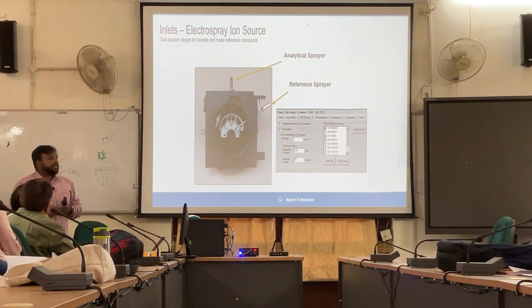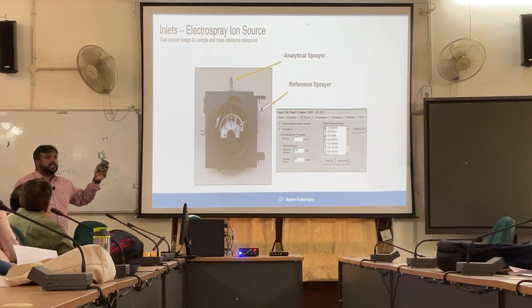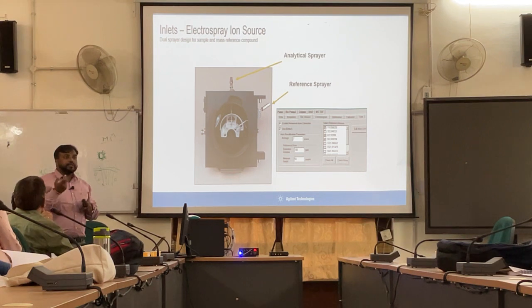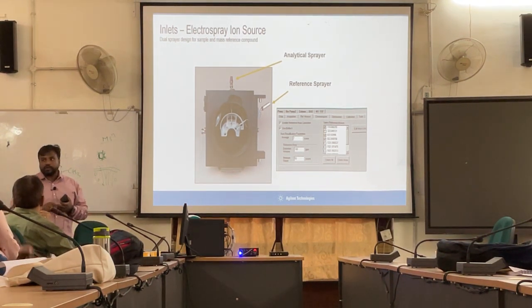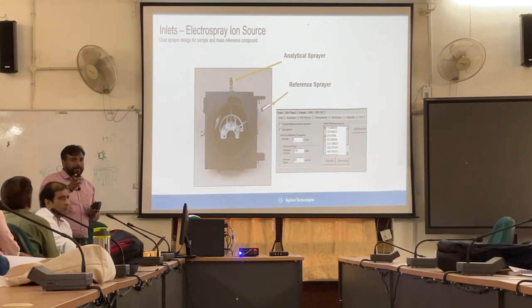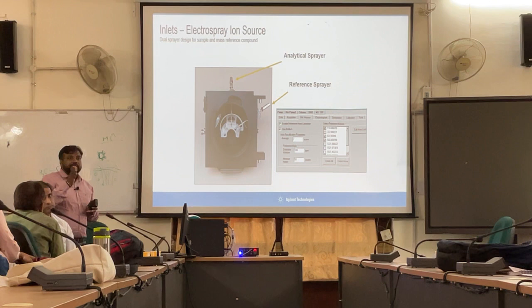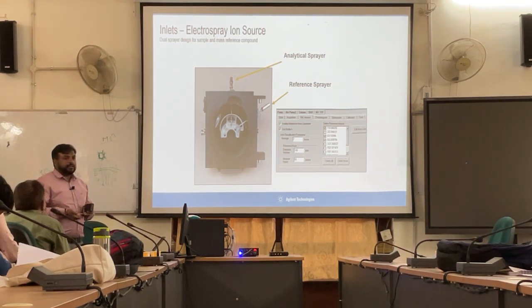In the reference masses, we have reference standard masses which you can choose according to your molecular weight. It is always recommended to choose the reference masses nearer to the value of your molecular weight, so that throughout the analysis this instrument is going to be calibrated. So the chances of mass shift would be reduced, even I would say avoided.